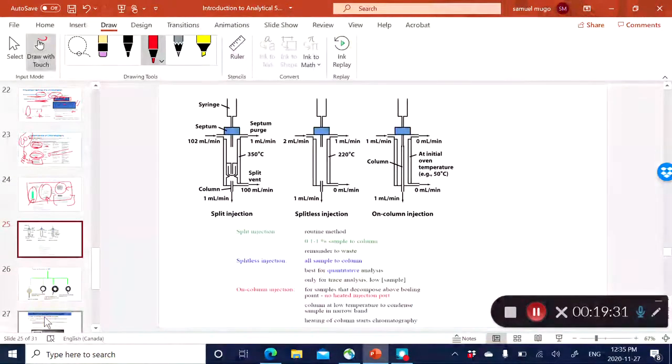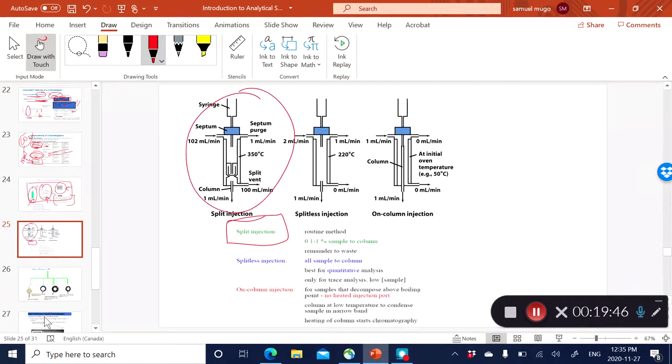You can operate gas chromatography in a couple of different injection modes. You can inject using the so-called split injection. And of course, you can see the injection port is just a small oven. So I inject my sample inside the heated oven, inside the GC. And so with the split injection, this is where a portion of the sample vapor is vented, whereas only a small portion is injected inside the column.